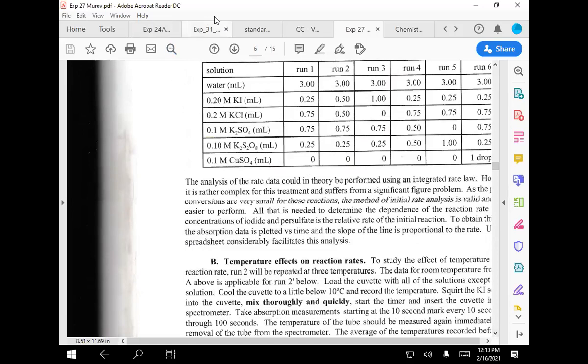In the video that we watched, there was a graph that was made. So we could look at the absorption versus concentration and make a graph. And they gave you the little Beer's law concentration.